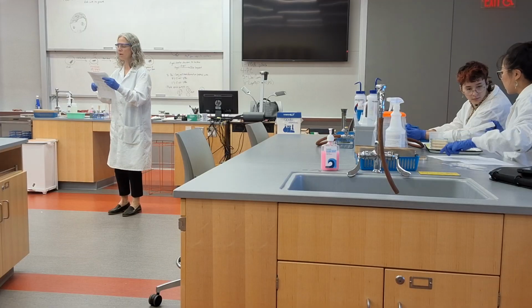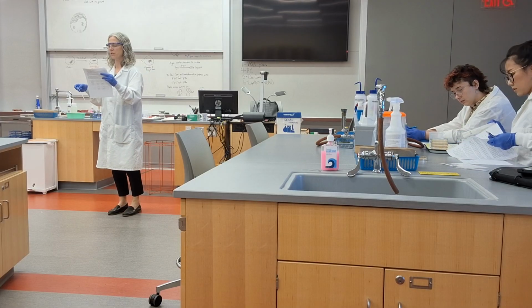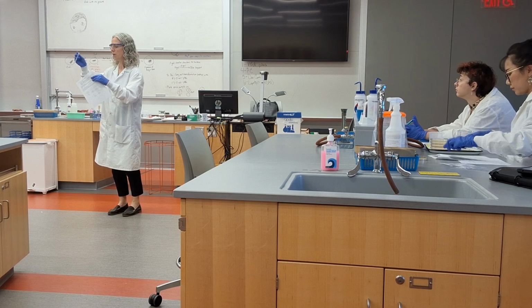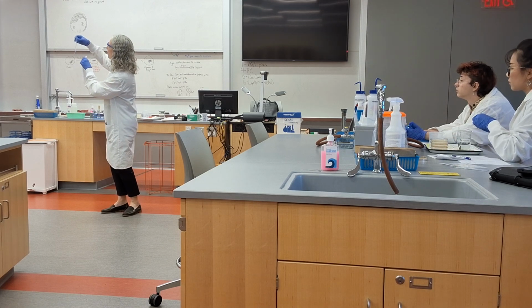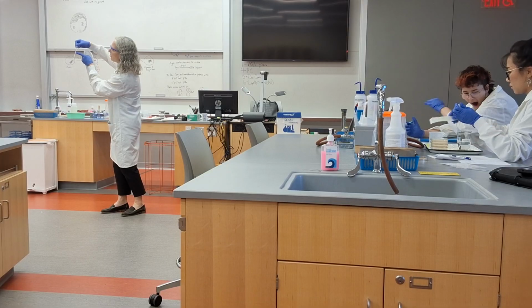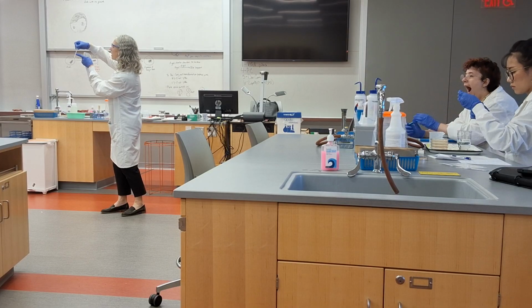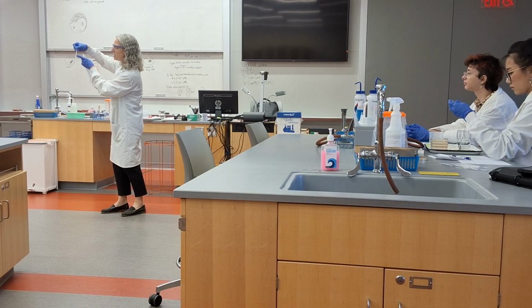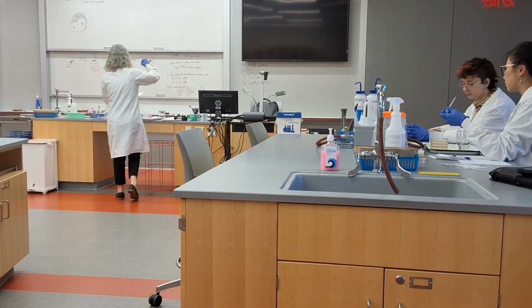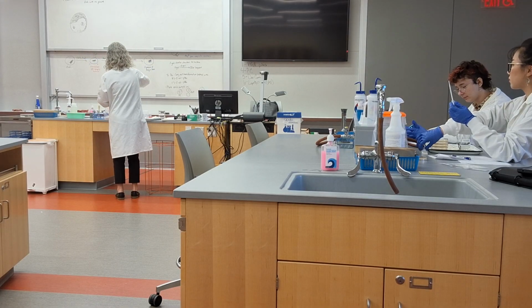So we want 250 microliters of ice cold calcium chloride. I think it's in the fridge or the freezer. I gotta go get it for you. But 250. Note that the line kind of in the middle here says 0.5. 250 microliters is also 0.25 mils, which is the line right below it. Okay? So when you aspirate to measure it, you are going to bring it up to that line.